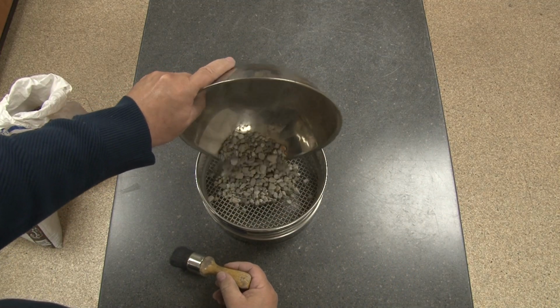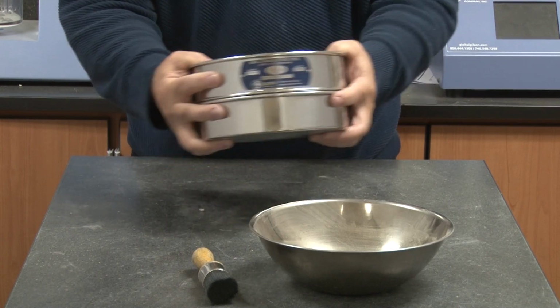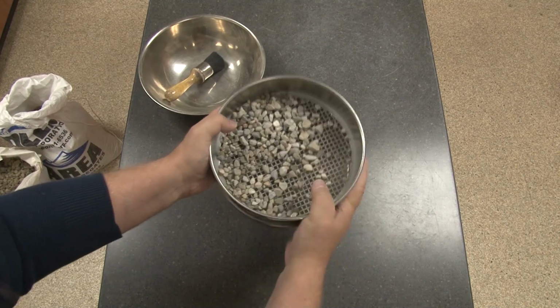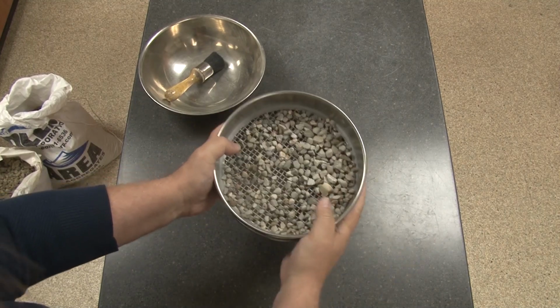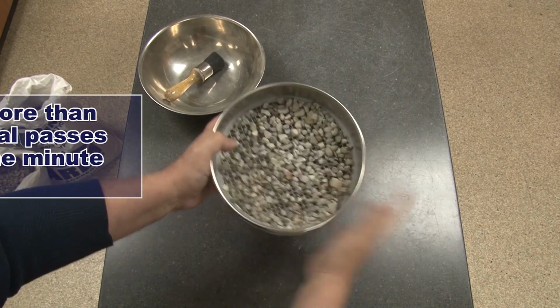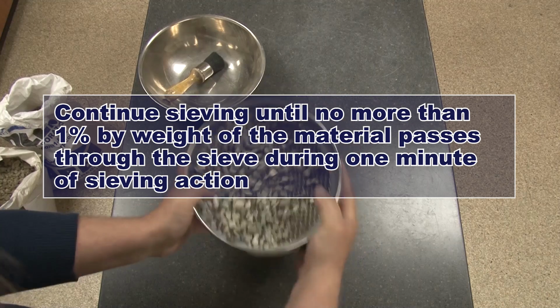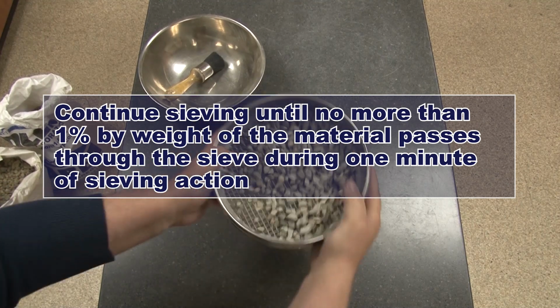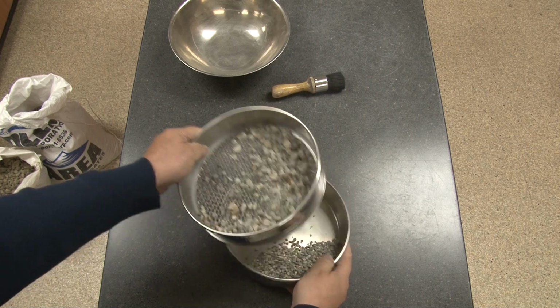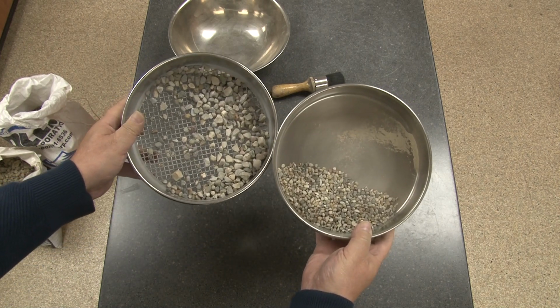While holding the sieve and pan together with both hands, sieve the material with a gentle circular motion and using your hand to repetitively tap the side of the sieve to promote passage of near-sized particles through the sieve mesh. Continue sieving until no more than 1% by weight of material passes through the sieve during 1 minute of sieving action. Now, remove and weigh the material remaining on the sieve to calculate the percentage of the bulk sample.